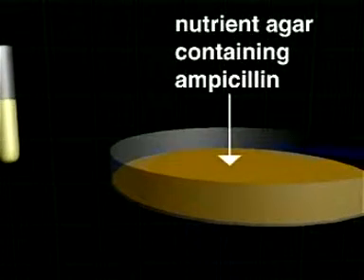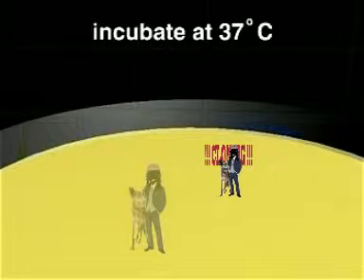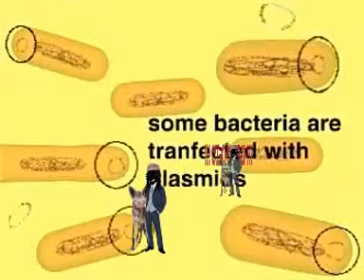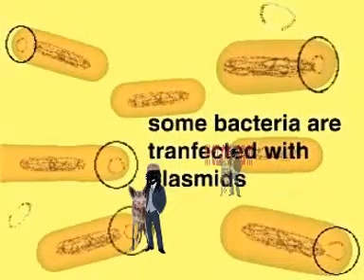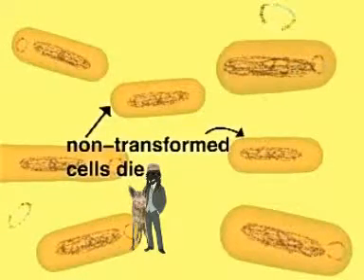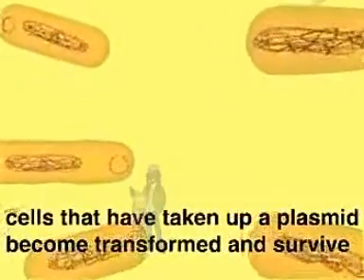The bacterial cells are poured onto a plate of nutrient agar containing the antibiotic ampicillin. With ampicillin in the agar, only cells resistant to the drug can grow. At 37 degrees, the cells will grow and multiply. Because they cannot move on the agar, each will produce a separate colony of cells. The non-transformed cells lack the plasmid with the ampicillin resistance gene and die. Cells that have a plasmid are resistant to ampicillin and survive.